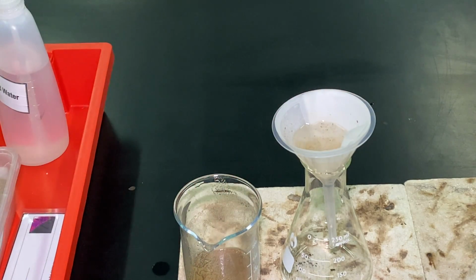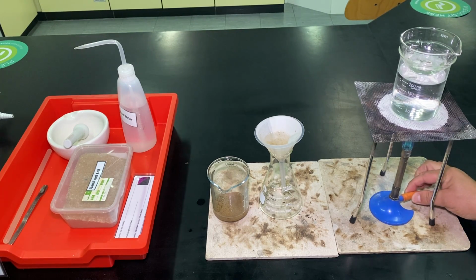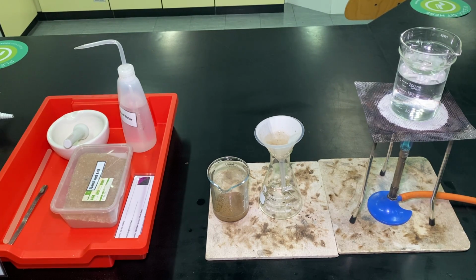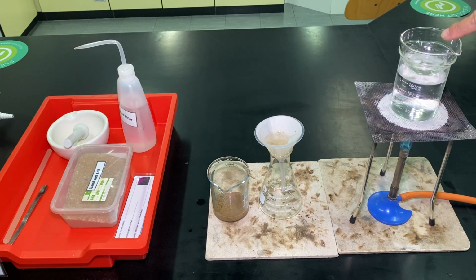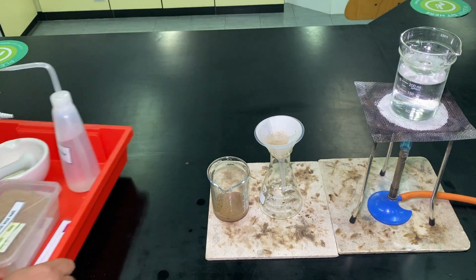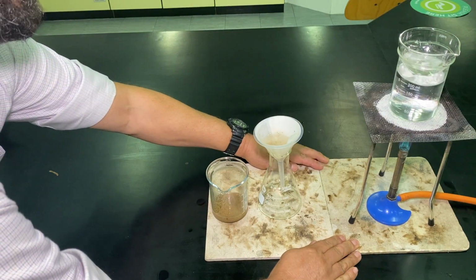Okay, and then we'll heat gently. We'll heat gently. So I just poured the sodium chloride solution into the evaporating dish. And now I will slowly evaporate the water. So again, that's a physical process.